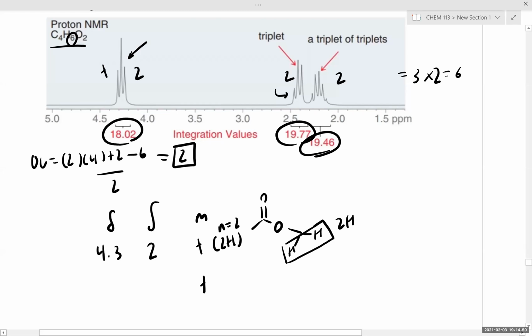And to answer that question, why are there two separate peaks? One trick that you can see is that when you have a splitting pattern, you'll often see this sort of convex pattern where the center peak is the highest of your splitting pattern. The other thing you can do is note the distances in the splitting pattern and the separation between the peaks, which allows you to calculate the J values. You don't need the coupling constant values in this case, but nonetheless, you can tell by the separation of peaks whether a set of peaks are part of a multiplet or part of two unique signals. Does that commentary make sense?